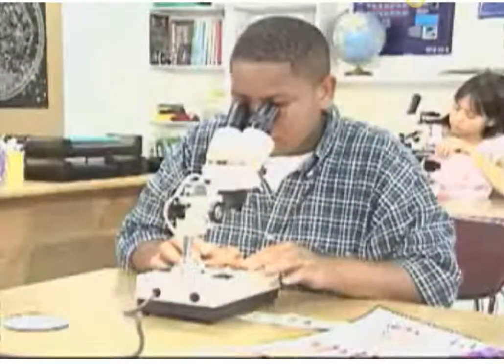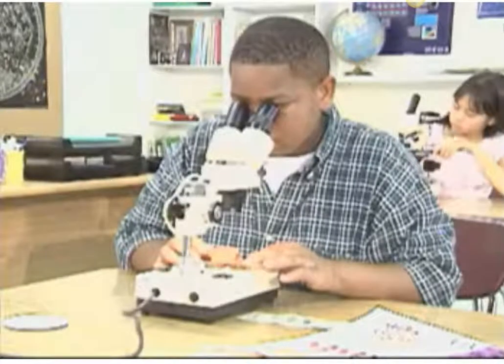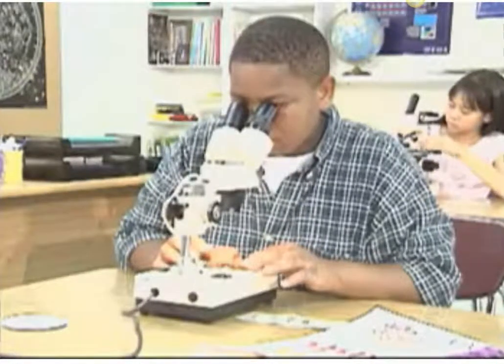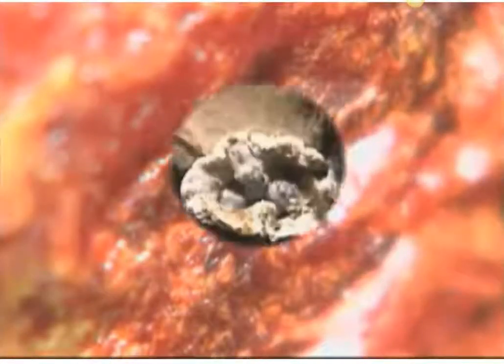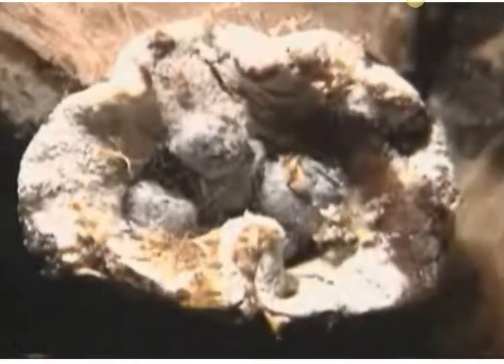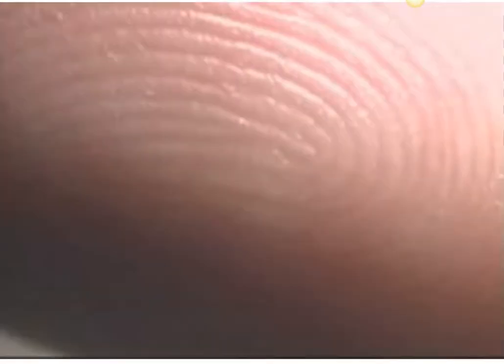Stereo microscopes usually have a maximum magnification of around 40. At this power, you will see that a smooth sheet of paper isn't so smooth at all, and neither is the surface of an egg. That a common mineral can resemble the surface of Mars, that a fungus can resemble a bird's nest, and mold a forest. You'll marvel at the pattern of ridges in your fingertips and discover that a picture is nothing but a sequence of dots.